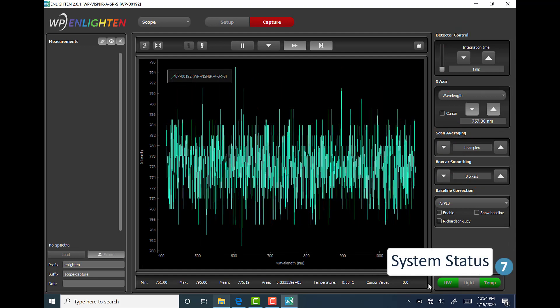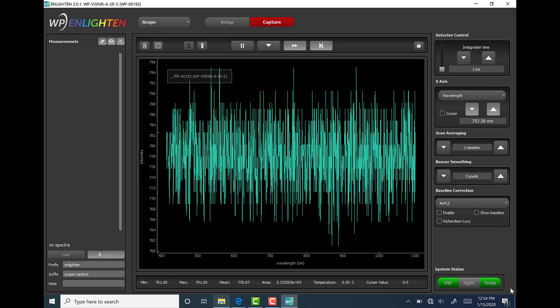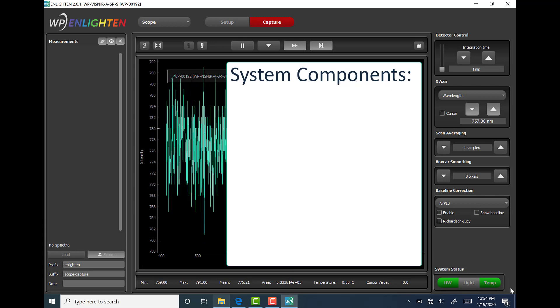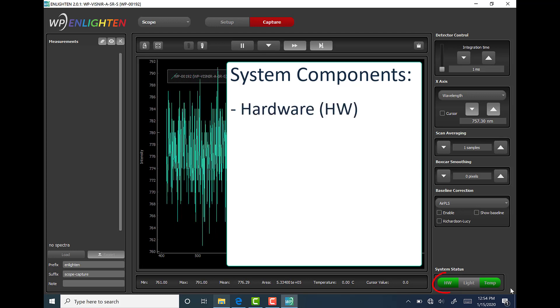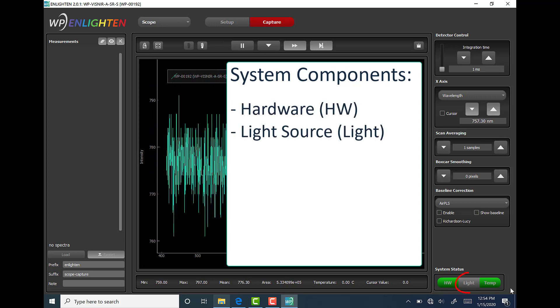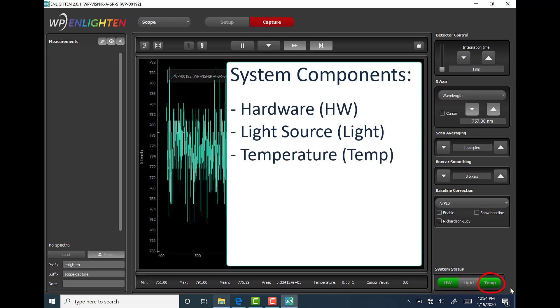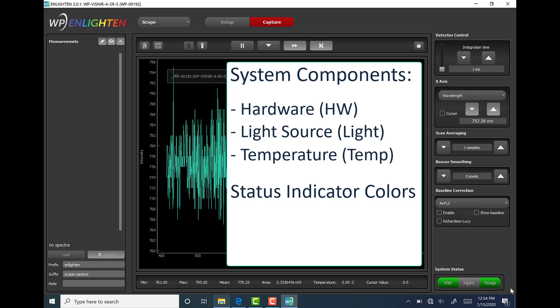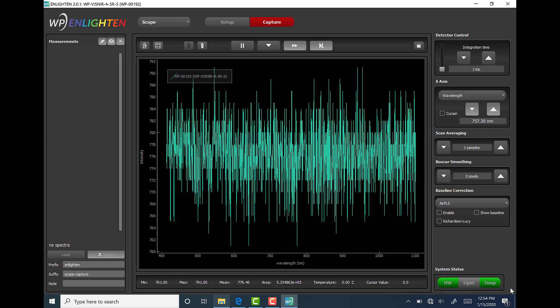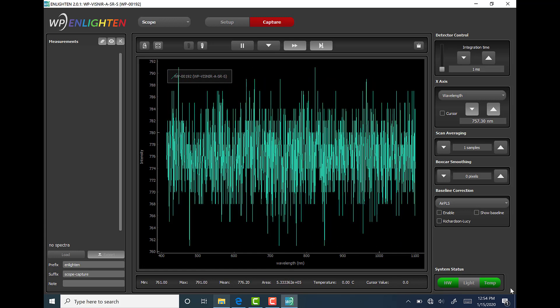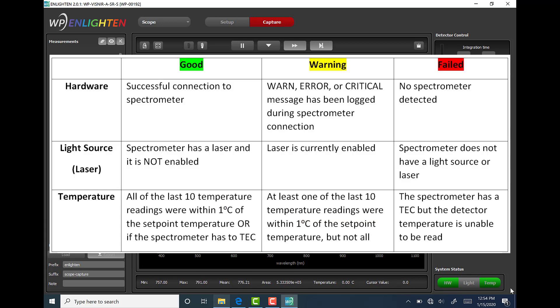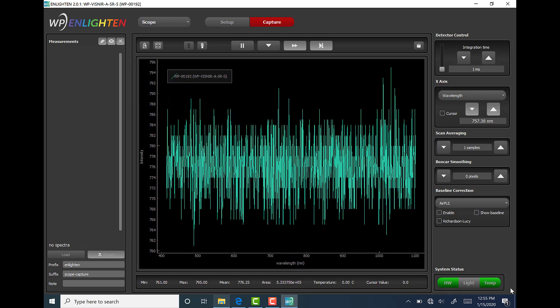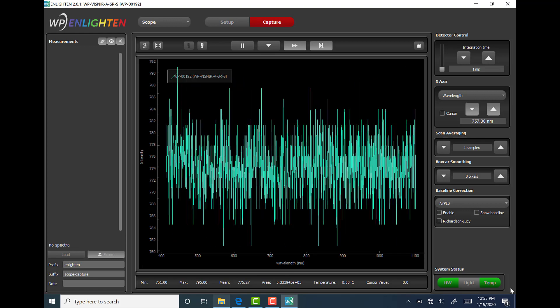The seventh area called system status is found at the bottom right hand corner of the software window beneath the user controls. The user can keep track of system components such as hardware shown as hw, light source shown as light, and temperature shown as temp. At a glance with these three status indicator colors: green, yellow, and red. To help keep track of the status indicator options for each of the system components, please reference the table on your screen. This table can be found as is in your product manual. Go ahead and pause your screen if you want to take a closer look. Technically there is a fourth color option, gray, which is shown when the feature isn't applicable for the current setup.